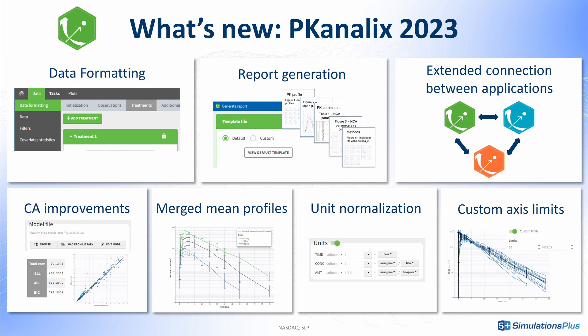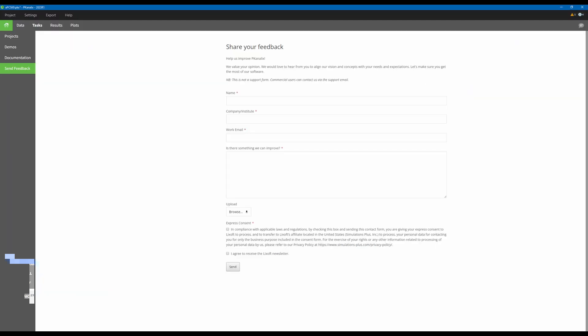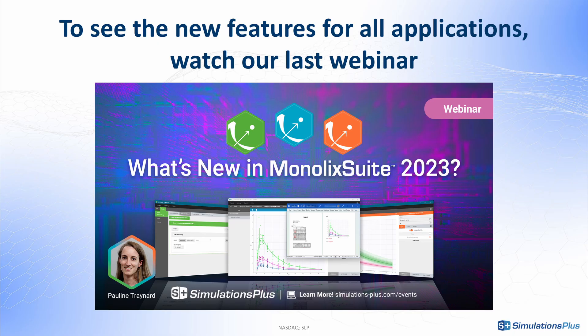What is your favorite feature? Tell us in the comments. In addition, to give us feedback and help us fine-tune the new features in the next versions, you can now use this form integrated within the interface. Enjoy the new version of PKanalix. To see the new features for all applications in more detail, watch our last webinar to see the Monolix suite in action with a PKPD case study.